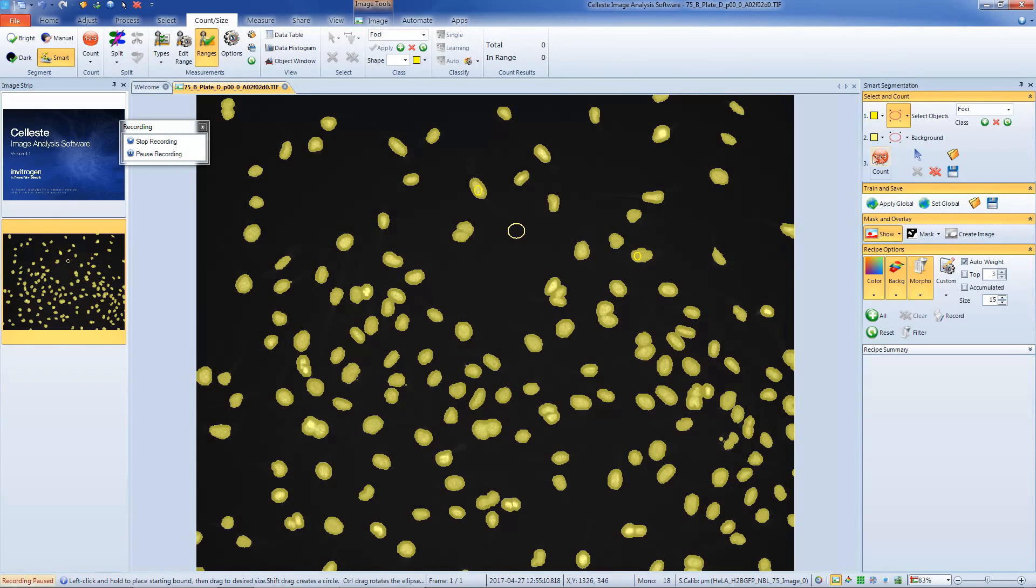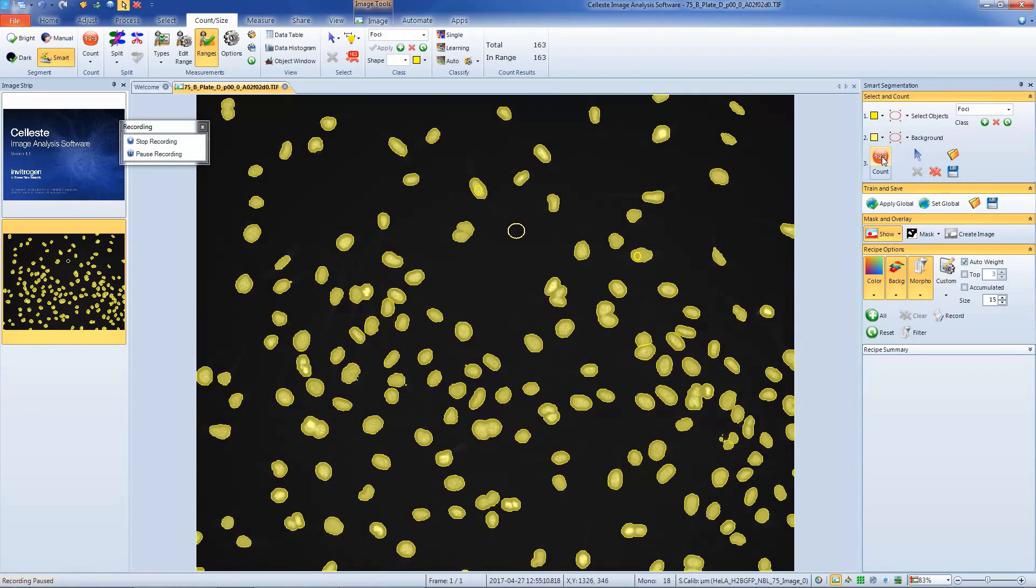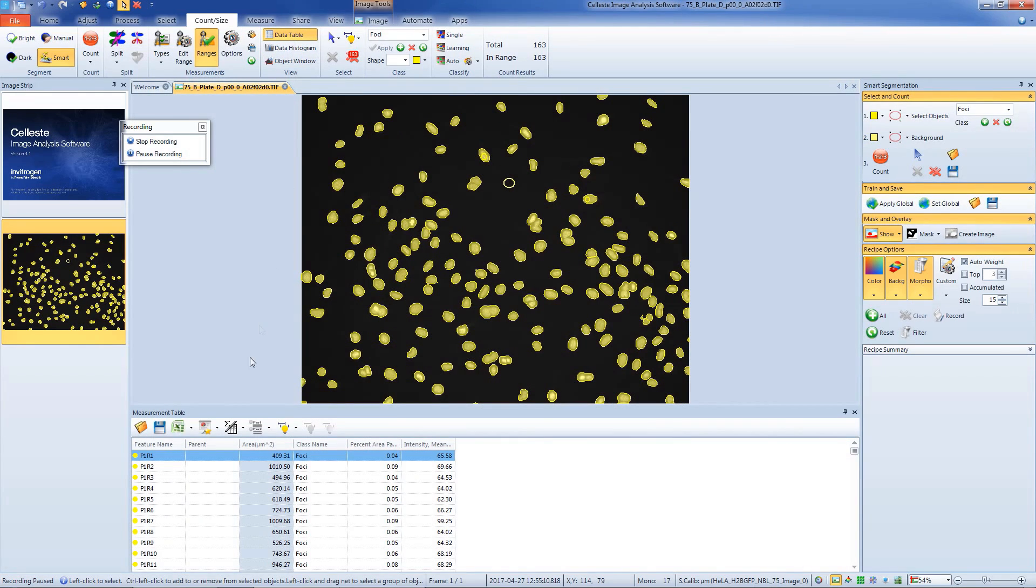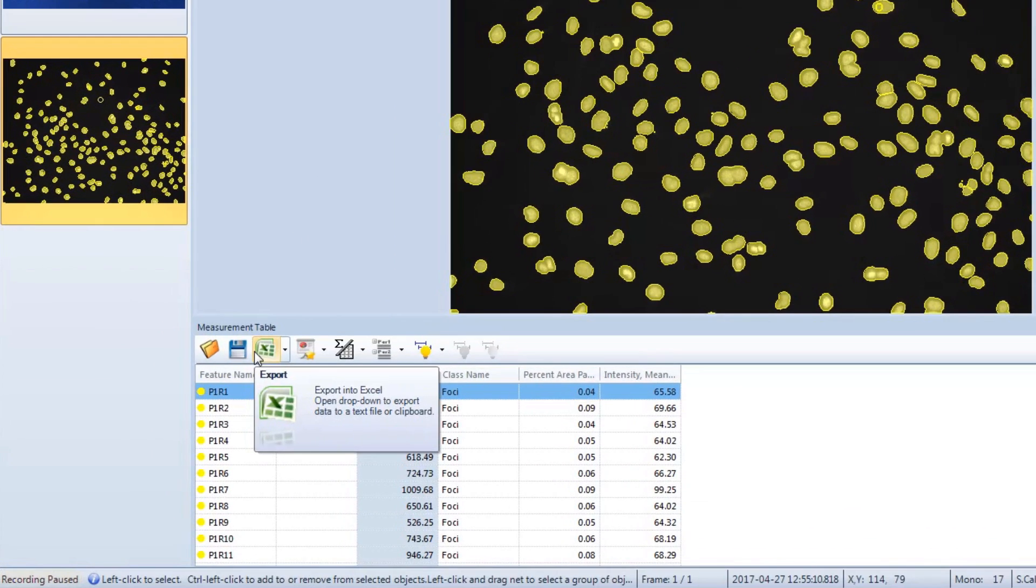Next, click Count to count the image. If desired, click the Data Table button and then on Excel to have data automatically exported to Excel software when a count is complete.